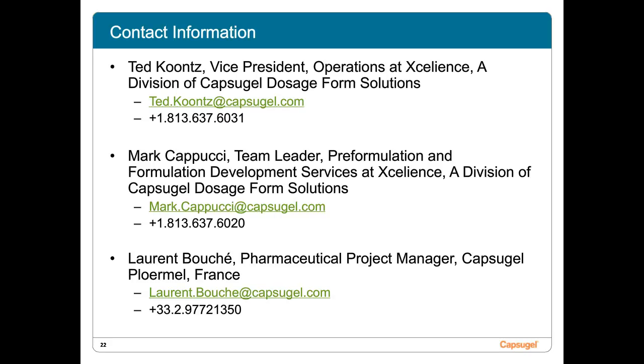Okay, thank you. Yeah, there was another one. Could you please clarify if the 120S at Xcelodose can also be used for GMP manufacture or just technical? The 120S that we have in the experimental area is used just for that. We don't use the 120S for any GMP manufacturing campaigns.